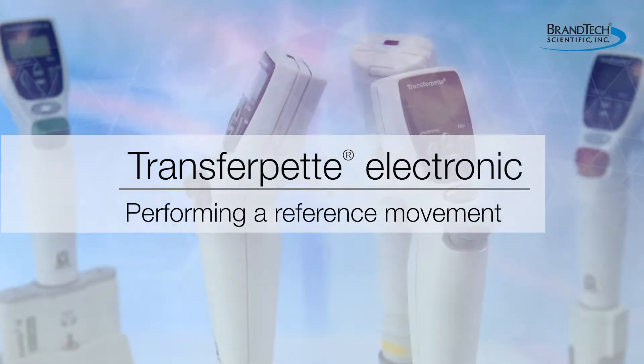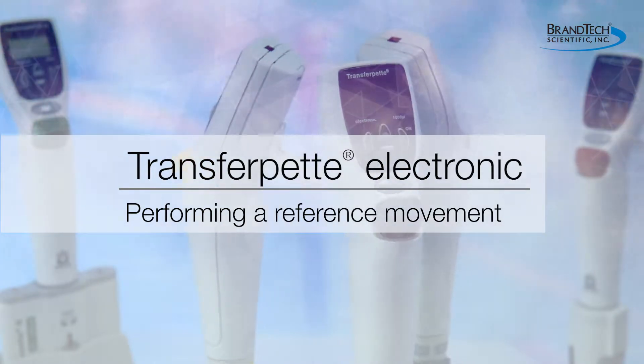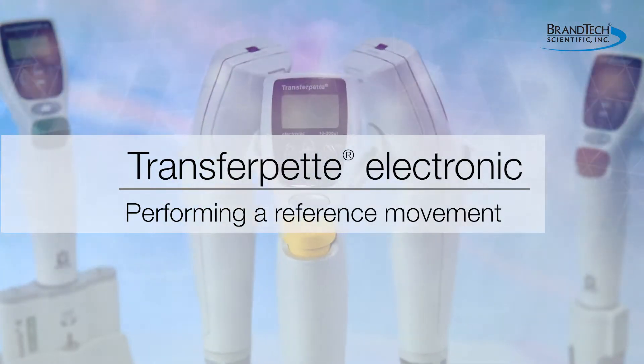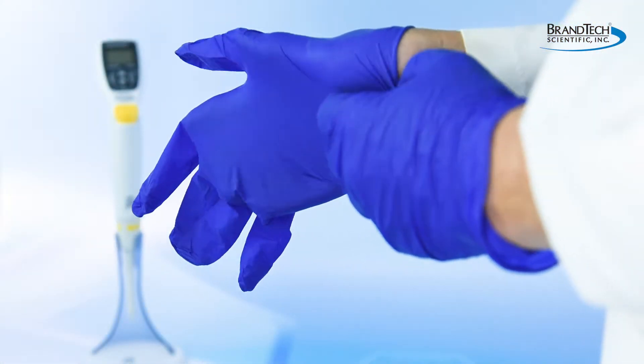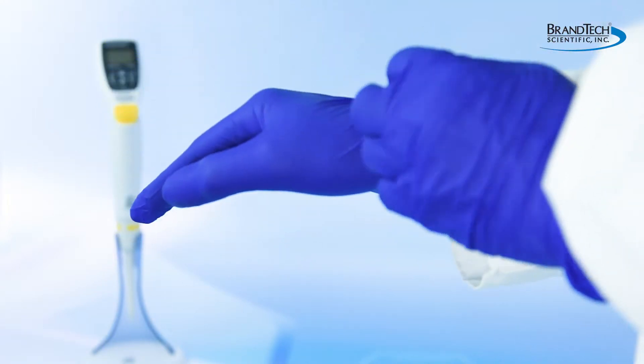This video explains how to perform a reference movement to realign the BRAND Transferpette electronic Pipette after disassembly. This is intended as a general guide and not a substitute for your operating manual. Before operating the Transferpette electronic, wear all appropriate personal protective equipment and observe all safety precautions.